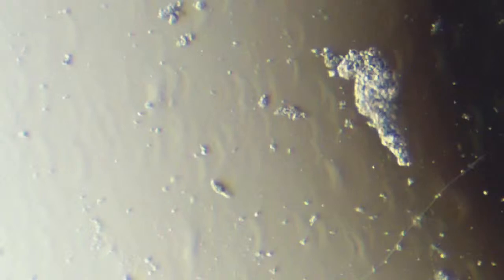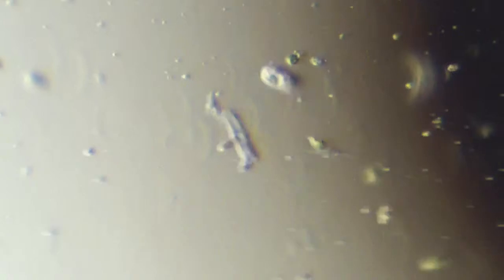And it's funny because these guys are actually putting out a lot of effort already. Considering their scale and how viscous water is on this small scale, they're already swimming quite a bit just to get through this stuff. But with methylcellulose down, it's a hell of a lot thicker for them to swim through, but still transparent. So for really fast specimens, sometimes I'll put methylcellulose in. It's kind of hard to add it after the fact because it comes whooshing in and you have to hunt all your specimens down again.